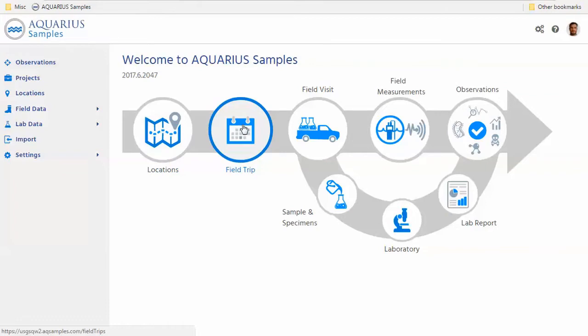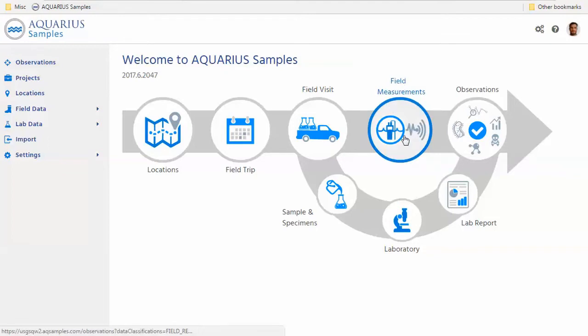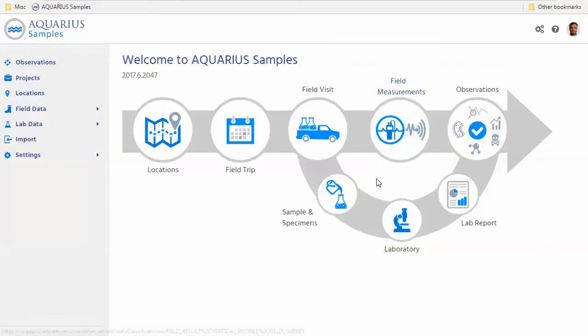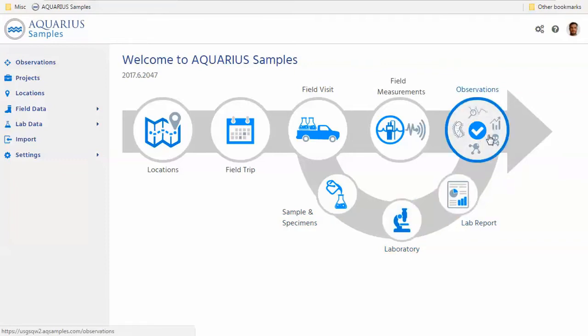We got field trips which are mostly an organizational item to plan and track who is going where and when, which gear and equipment to bring, and we got the field visits which describe then the actual planned and also the completed fieldwork. Furthermore, we got the two main data streams which are the in-situ field data, everything you can measure right there and then, and we got the ex-situ data which will require samples and specimens to be collected, be sent to a laboratory for analysis, lab reports to come back, and then both will end up eventually as observations which will then be available for your analysis and investigation.